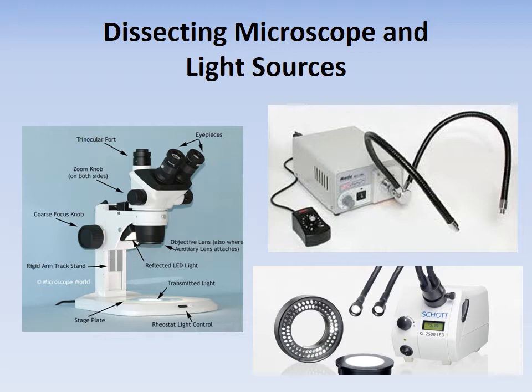When shining your light, if you do have these wands, you're going to play with the light and make sure that the subject is being lit up as much as possible with the light that you're using. You want to make sure that it's not in the way of the actual view.